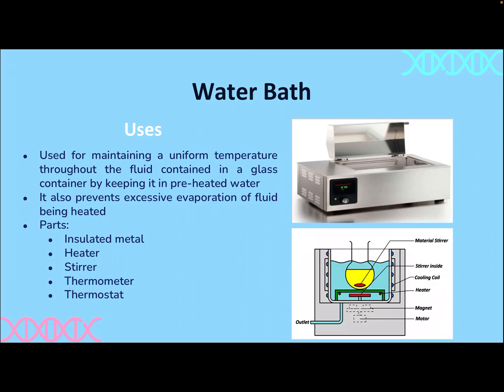Next is a water bath. Water bath is used for maintaining a uniform temperature throughout the fluid contained in a glass container by keeping it in a preheated water. It also prevents excessive evaporation of fluid being heated as compared when we use flame to heat fluid.